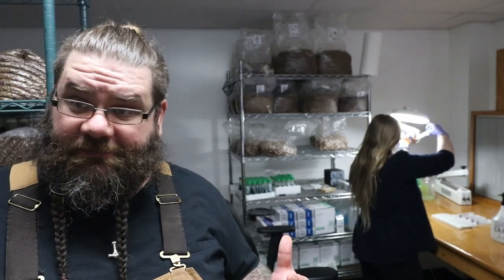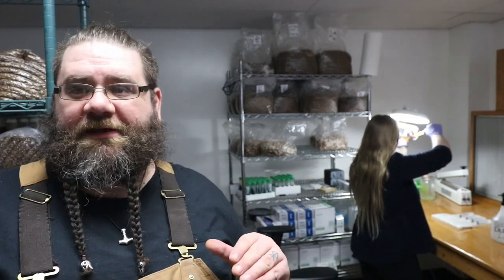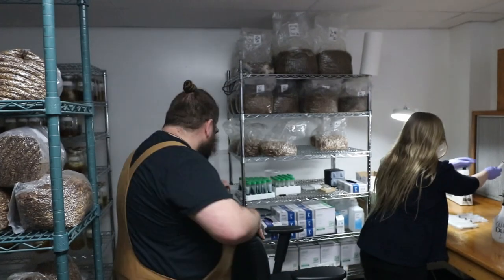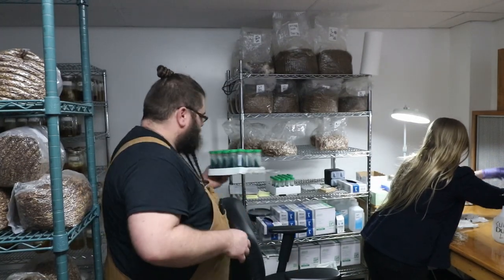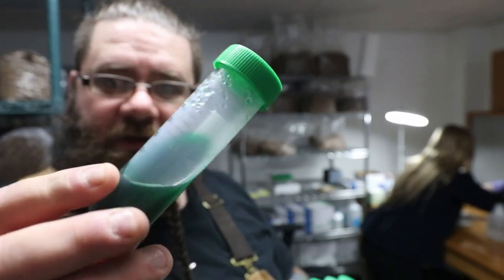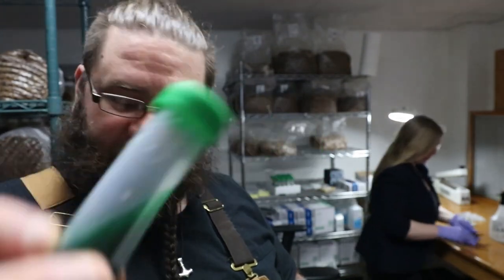So, All-American sterilizers are fantastic for one reason, really. They hold pressure the best that I've seen out of the autoclaves or the pressure canners. Which means when you're trying to make something like pre-made slants, it really helps for these things to be able to cool under pressure. Otherwise they can boil out.